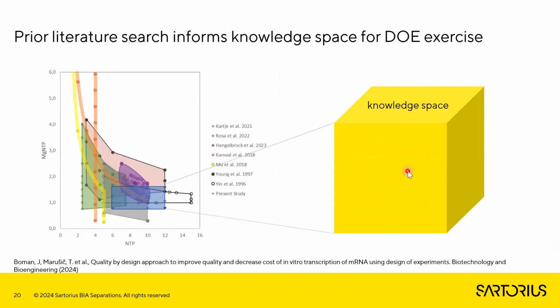The first part of the exercise was actually to do some reading. There are multiple prior publications which looked at the effect of process factors on mRNA output.